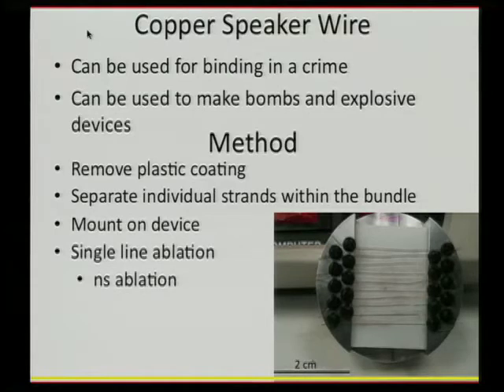And so what we did was we removed the plastic coating, and we separated individual strands within this bundle of strands. And I'm really glad that I wasn't the student that did that, because it took this particular undergraduate about 3 months. So I can say that I'm quite glad that that was not my job to separate these strands.